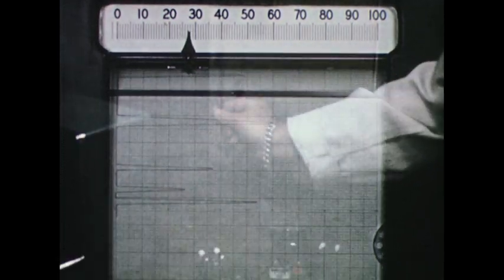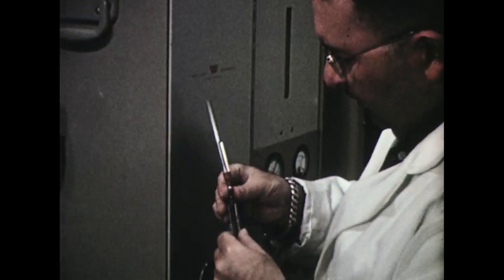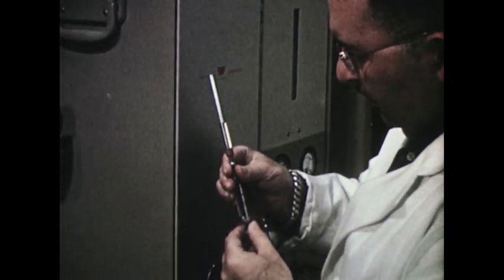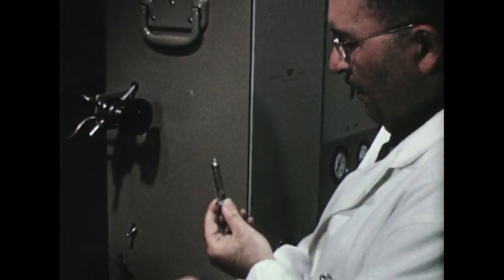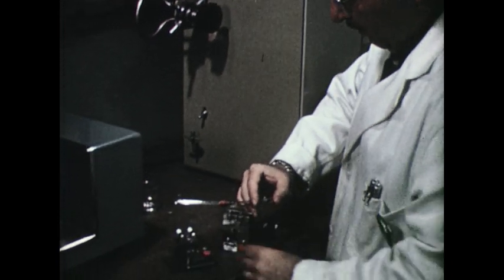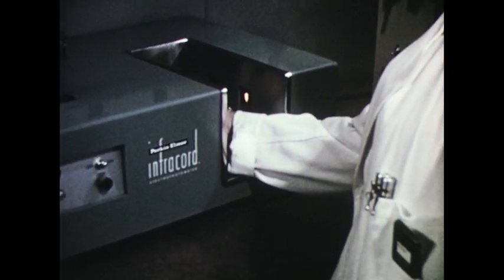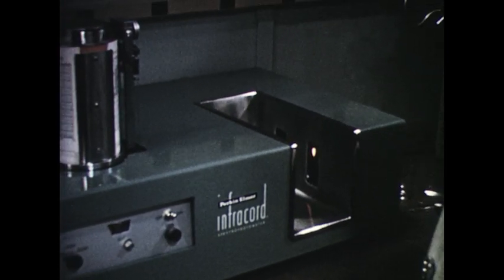These components are collected and transferred to an infrared cell. The components are then identified by their infrared absorption spectra, using the matched cell technique to eliminate the bands of the collecting solvent.